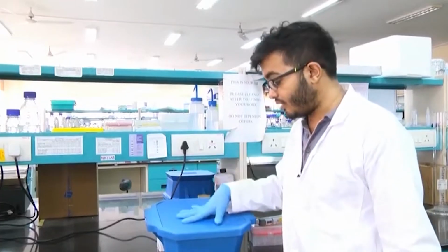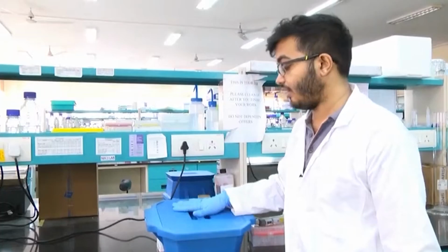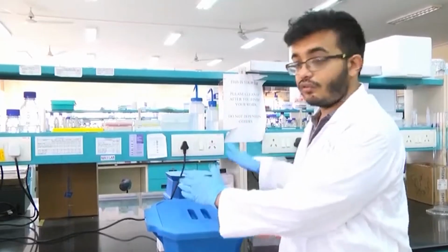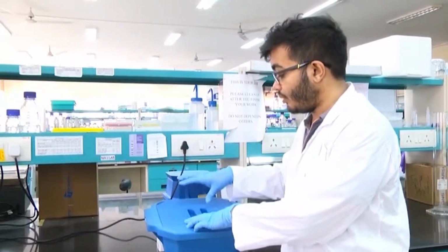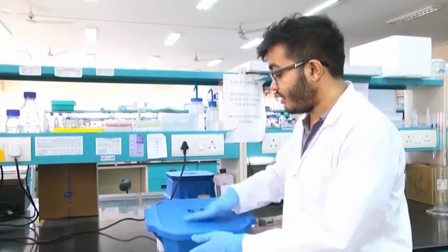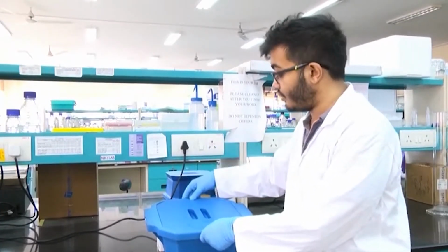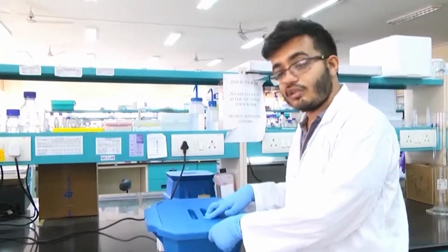So, always keep an eye and make sure that you keep refilling the ice or packing it tightly, so that most of it does not melt. Or what you can do is, you can take this entire ice bucket and keep it in the 4-degree fridge. These modifications are applicable only when the ice can melt quickly, like in our case during summer it gets very hot. But if your lab is in a very cold place, all the ACs are always on and you do not have an issue, then you do not need to carry out these modifications.